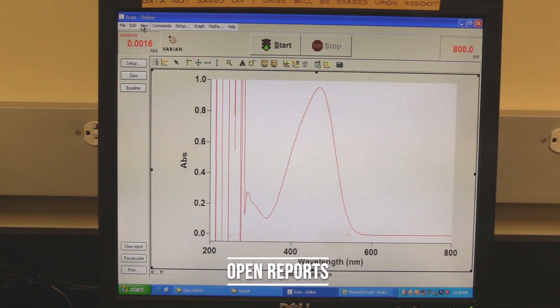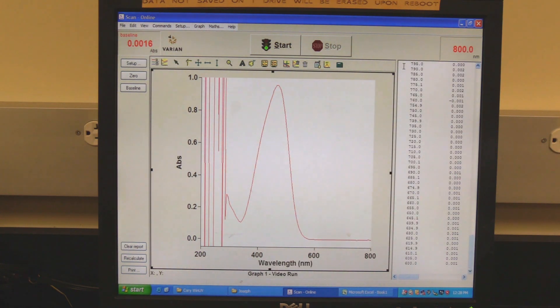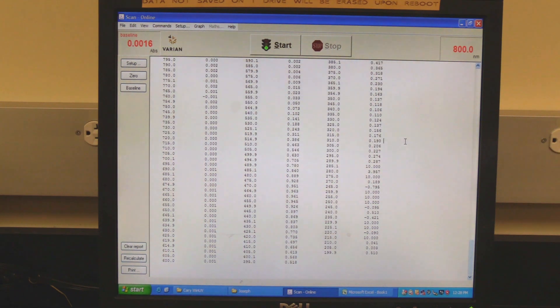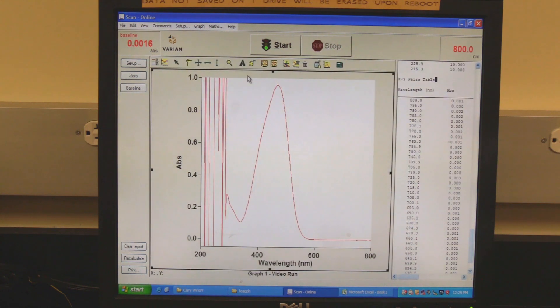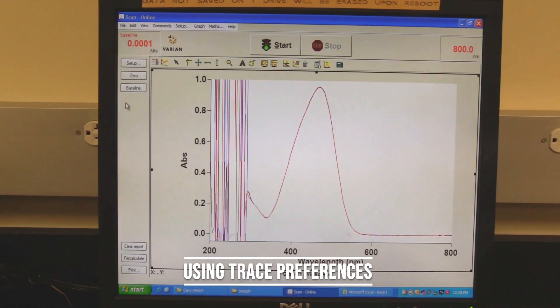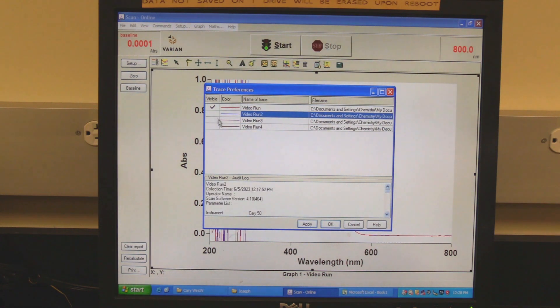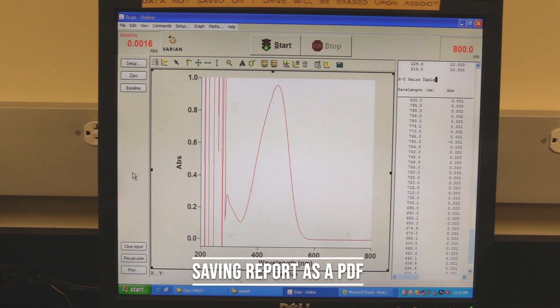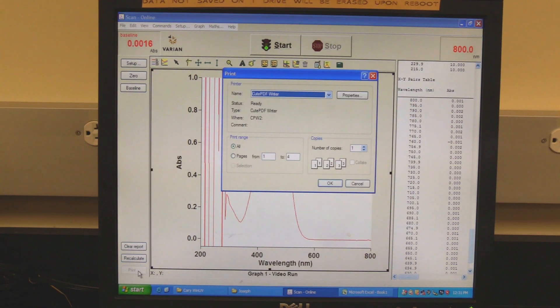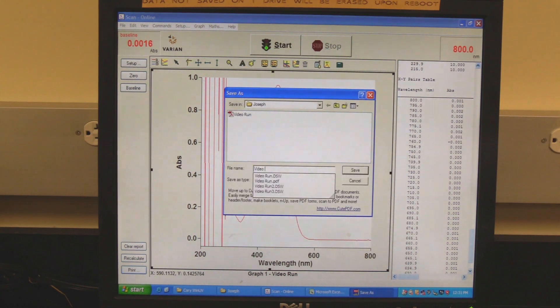Open Reports: if the Reports window is not open, go to View and then click on Reports. Double-click in the Reports window to expand it to full view; double-click again to collapse it. Using Trace Preferences: click on the Trace Preferences button above the spectrum, check or uncheck the desired spectrum, and click OK. Saving your report as a PDF: click on the Print button, select CutePDF Writer as the printer, click OK, and save the PDF file in the desired folder.